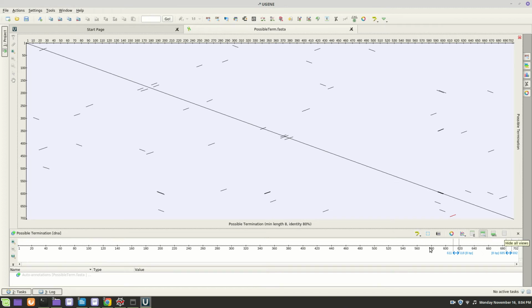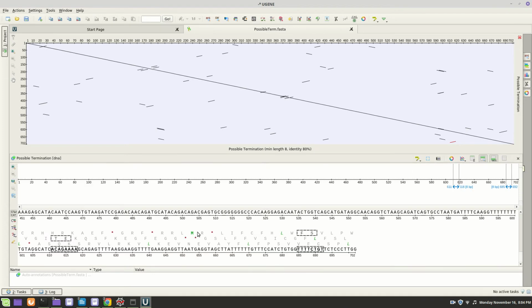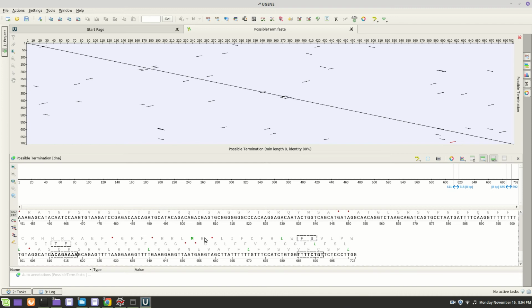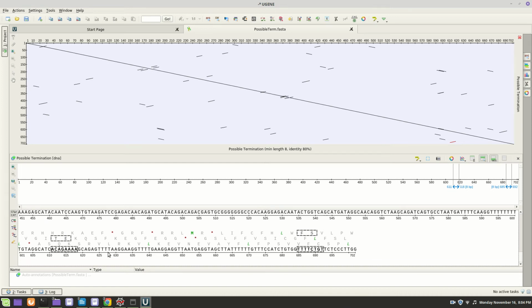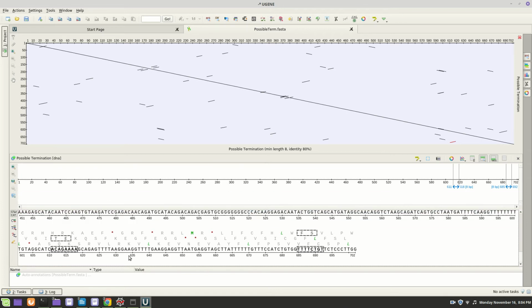I want to do the sequence. Not giving me all the options here. Let me see. Nope. There we go. Alright, that's too small. But GG, AG, ooh, that might be. So let's make it a little longer. This might be it.